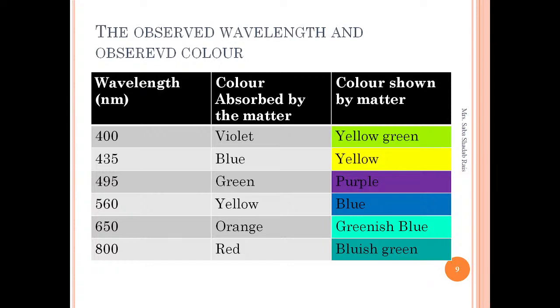That liquid should be translucent. Why? Because just now I told you that if the substance is translucent, the light will be partially absorbed, and the remaining light that passes through can be used, or counted, to find out how much concentration of the analyte is present.